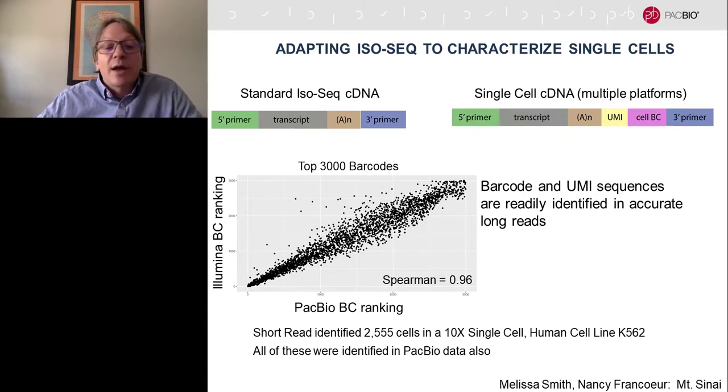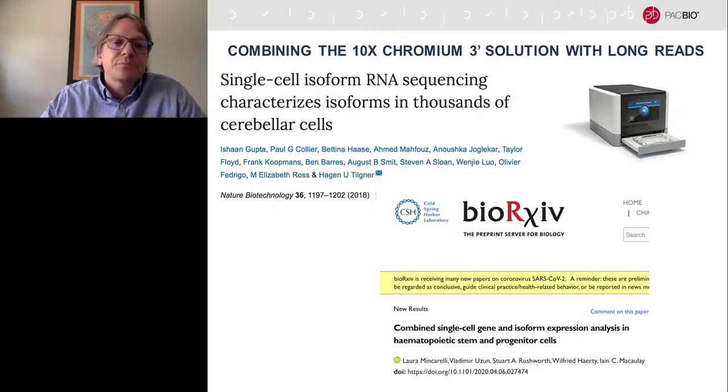And this is by directly reading the FASTA information out of the sequencing. It's not by looking at the barcodes off of each other. So we thought this is something that we could use PacBio to study single cell libraries that were already being generated by people on a short read platform and getting the 3' information, for example.